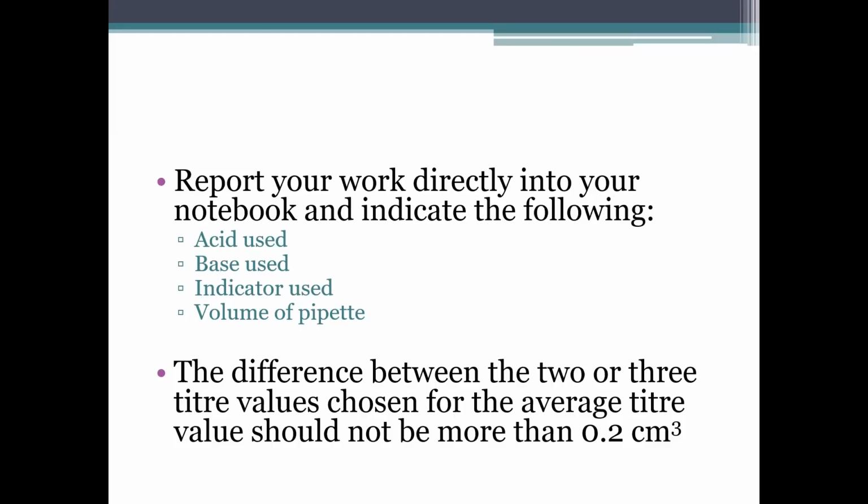If there is a need for you to cancel, you can cancel. Nobody will penalize you for canceling. Your cancellation must just be neat, not rough. So in your lab notes, you record the volume of the acid used. So you have to state the name of the acid used. There'll be a mark for that.